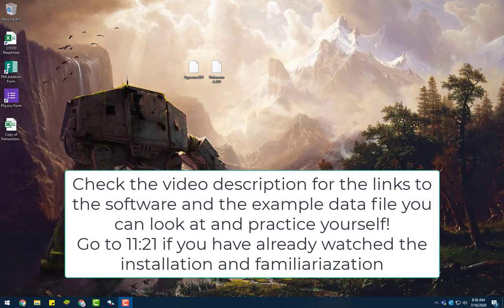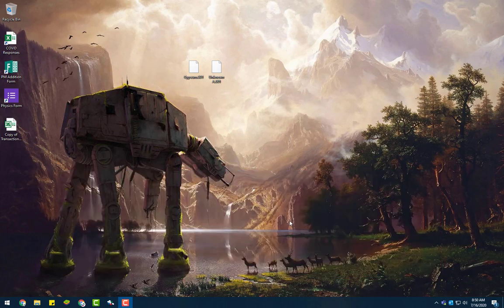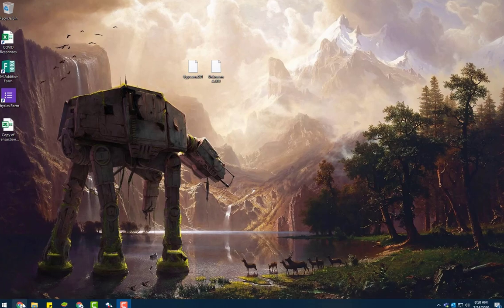So this first section of this video is going to apply to both DSC and TGA, and I suppose also DMA data workup. I'm not going to be too specific on instrument model, because we're going to be able to use this one software to analyze all the different data types from the different instruments. So I'm going to go over how to download and install the software.